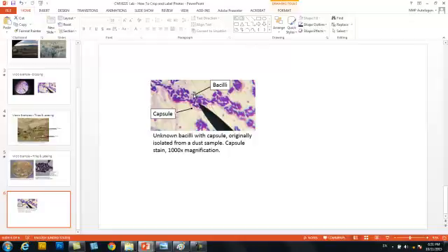Okay, and then here I'm going to put it actually on a cell as opposed to a clear spot. Let's click over there, and that's not real clear. Let's go ahead and move that so that it's, oh, let's go with this nice big bacilli there. Yeah, that's much better. Now, because I want to make sure, well, that's still not on the clear spot. So you gotta jiggle it, get it so that, okay, that's much better. And just so that everybody knows that I know what I'm talking about, clear space around cell.